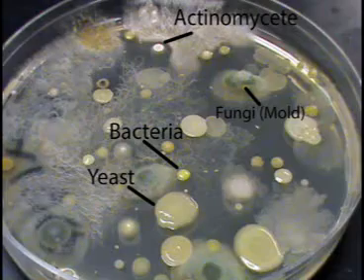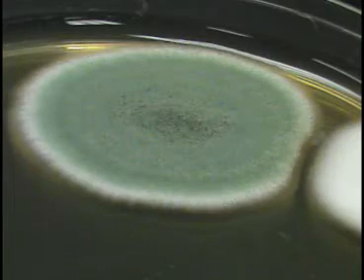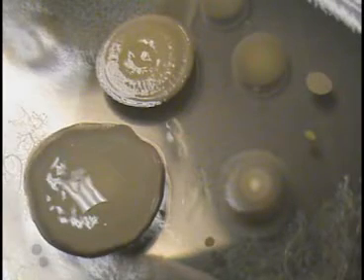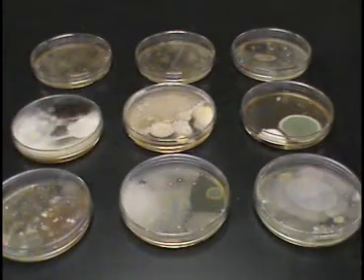The 3 different agars being used are each used to promote growth. Glycerol yeast extract promotes actinomycetes. Nutrient agar promotes the growth of bacteria. Sabdex promotes the growth of fungi. Yeast are another form of fungi. Using a simple serial dilution and 3 different types of enriched media, you should be able to observe and quantitate the diversity of different organisms found in soil.